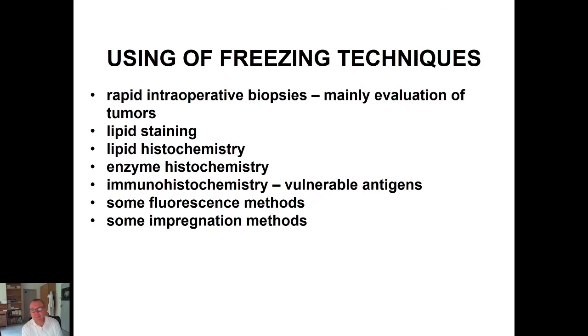To freeze a specimen is a question of some seconds, and the sectioning can last several minutes if there is good staff with good sectioning skills.